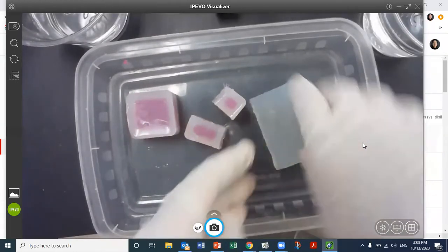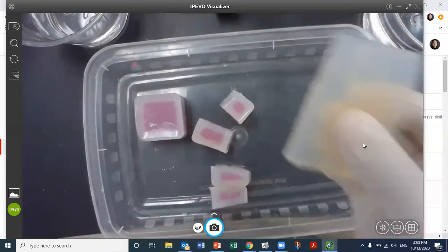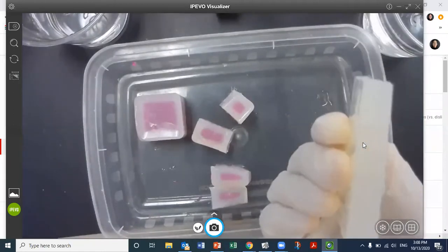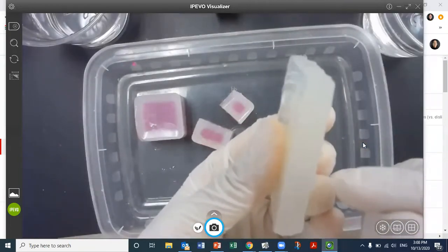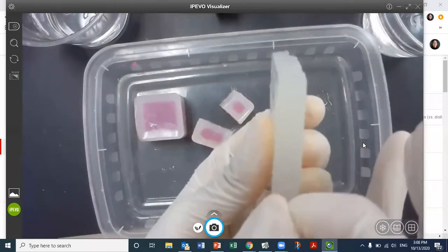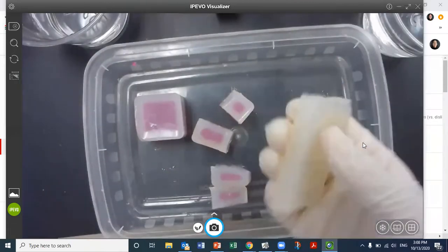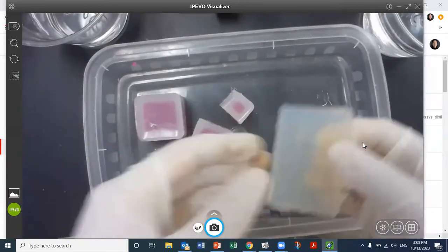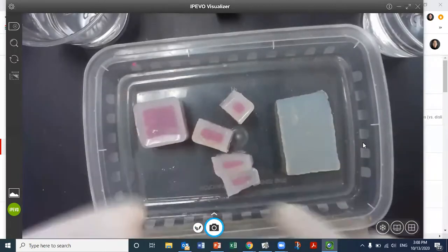An observation you might make about this one is that it started off totally fuchsia, right? This shape, but we also know that its height is only 10 millimeters. So if you were to diffuse 5 millimeters from the right and 5 millimeters from the left, it would meet together in the middle, and that would be 10 millimeters totally diffused. And therefore, we no longer see any fuchsia because 5 millimeters, 5 millimeters, and 10 millimeters, the whole thing has been diffused through already. So you can already kind of tell which one diffuses the fastest, right?